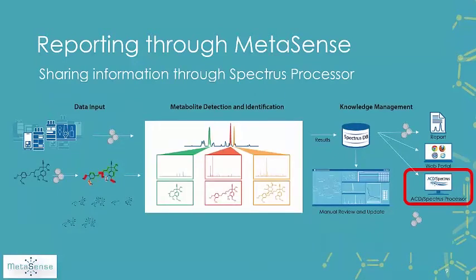The second way to share the results is through Spectrus Processor. As I mentioned, it is our entry-level data processing platform. And this is really for those who already have Spectrus Processor deployed in their organization. We have a number of clients and customers who already have Spectrus Processor in their synthetic or medicinal chemistry groups.